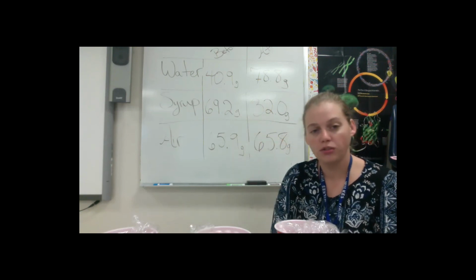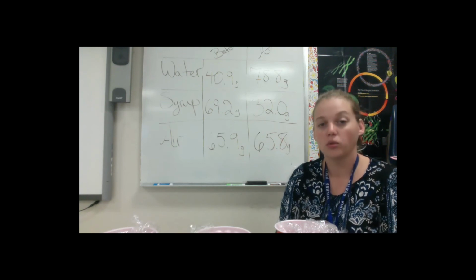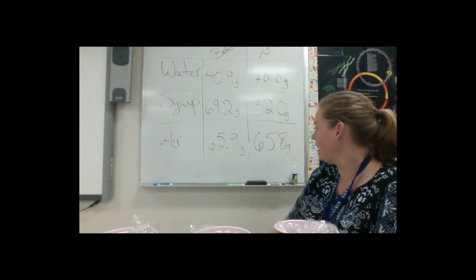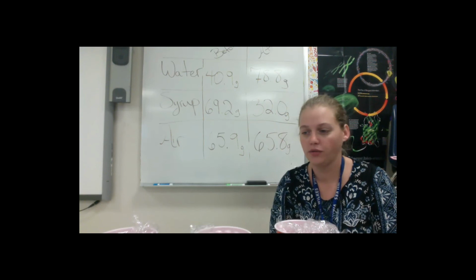You can also remember this by salt and sugar suck. Wherever there's more salt and sugar, there's less water. So the water is going to go toward the salt and the sugar. With our air egg, you can see that it lost just a little bit of mass, and we'll come back to that here in just a few minutes.